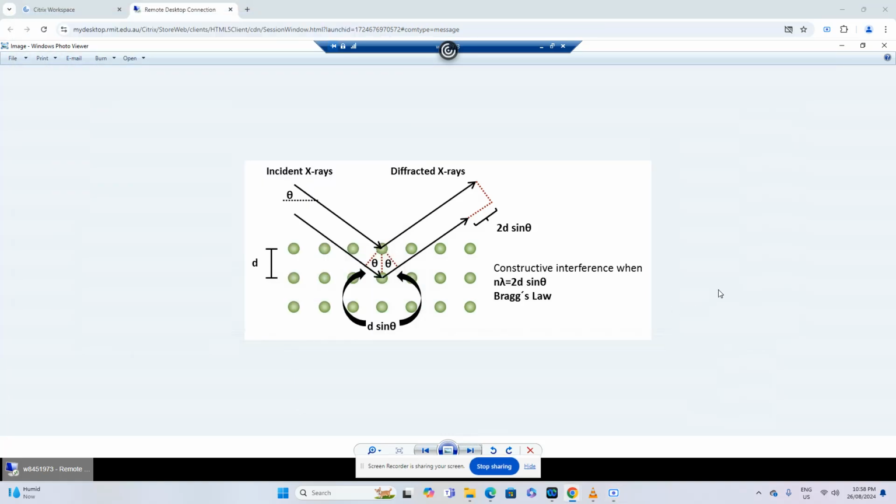Hello everyone. Today we will discuss X-ray diffraction, which is a very important material characterization technique. X-ray diffraction is a versatile, non-destructive analytical technique which is used to analyze physical properties such as phase composition, crystal structure, and its orientation in the powder and a fully dense solid sample.